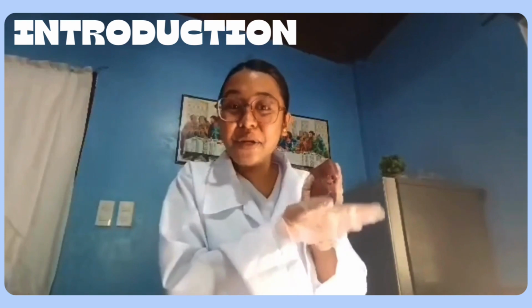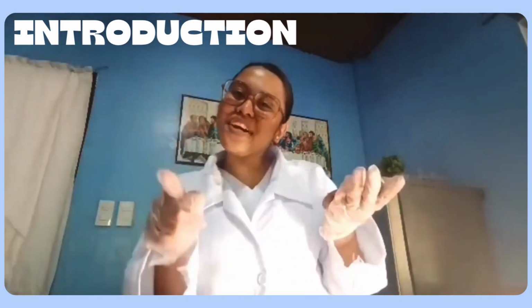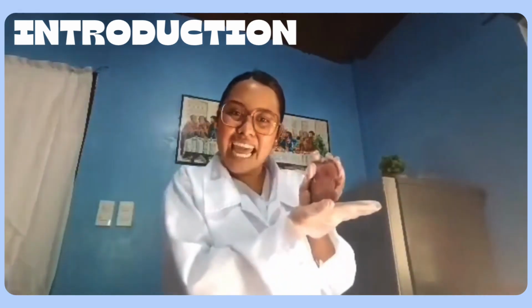Have you ever wondered what the internal structure of the kidney looks like? If you're curious just like me, let's dissect this kidney.